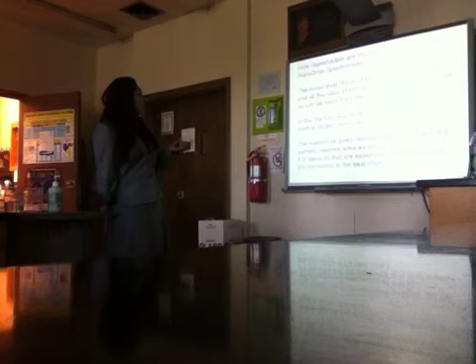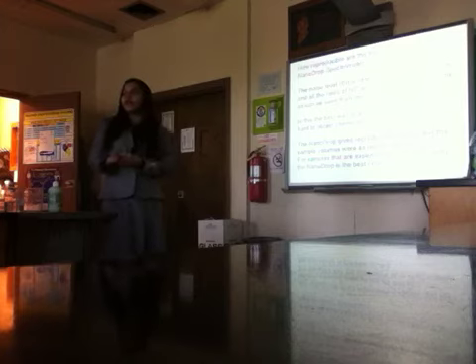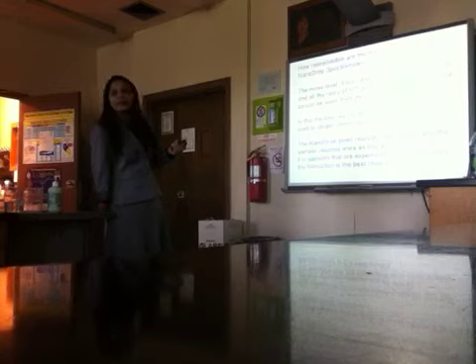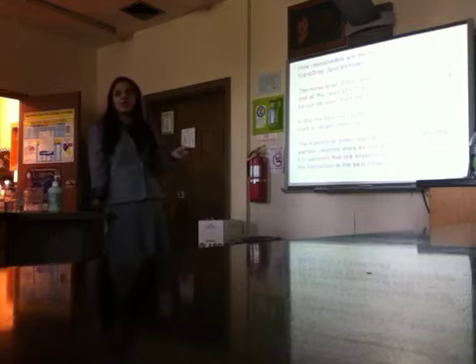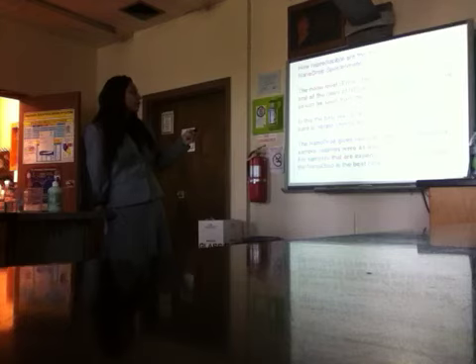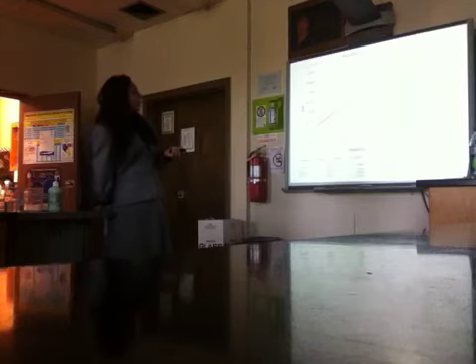Thanks. And is this the best way to analyze a small sample of how to obtain the chemicals? Yes, because with the nanodrop we have to use just 1 drop. So if we have 200 microliters of solution, we can measure 10 times, so we have 10 points. So it's the best way. And if the sample is expensive, we can use a small amount.